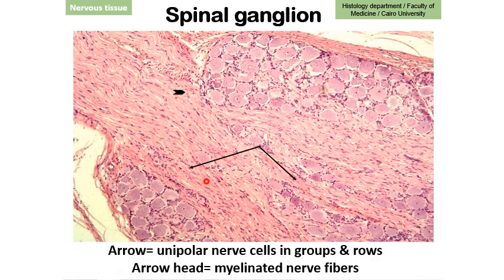This is ganglia, formed of nerve cells arranged in groups or in rows. The cells are unipolar, from where you know the boundary is regular. The cells are large, of different size. The capsule is thick. So again, thick capsule, the cell rounded edge.